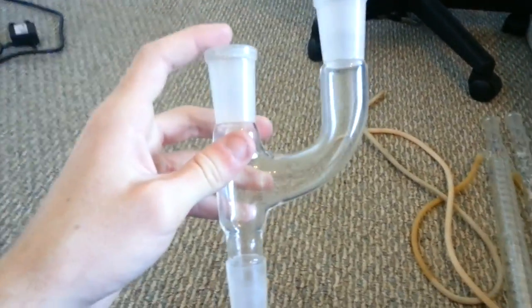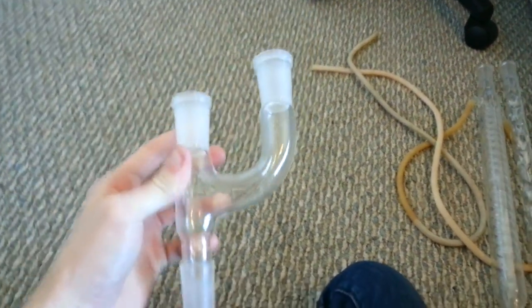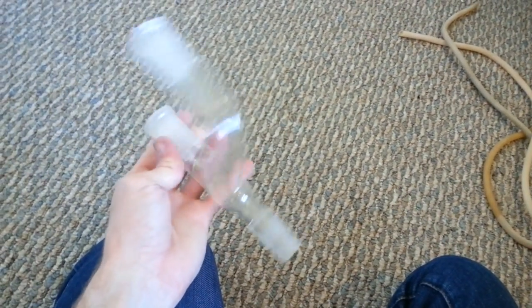This guy is simply something to take two kinds of liquids and put them together into something. I honestly have not used this. You should probably have it — it's good to have — but I haven't used it yet, so I'll leave the decision up to you.